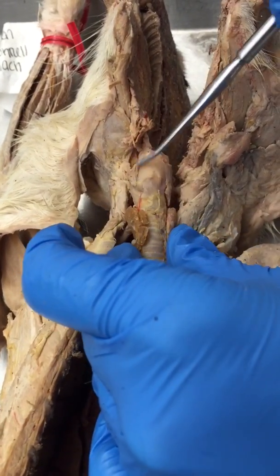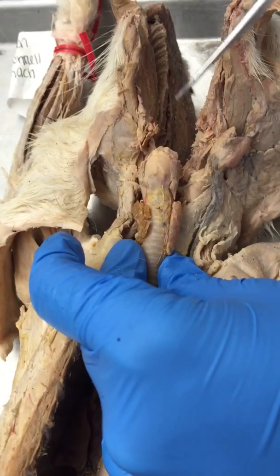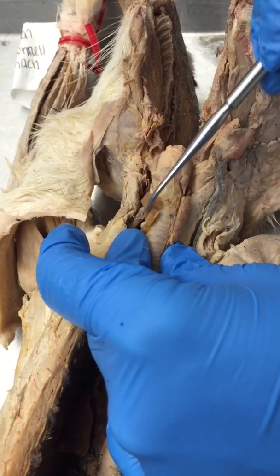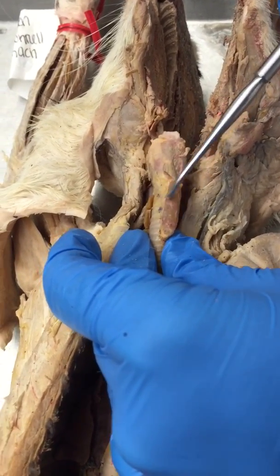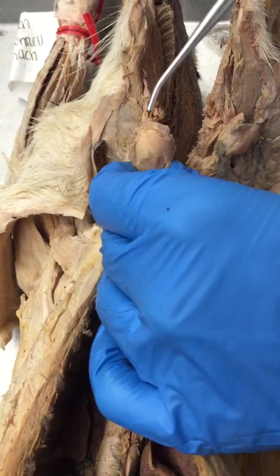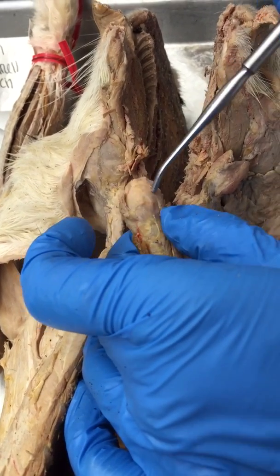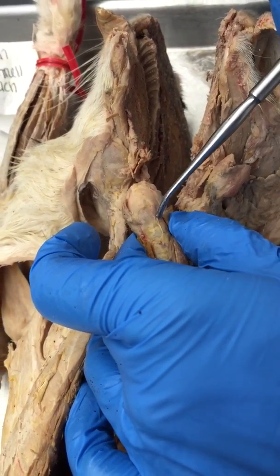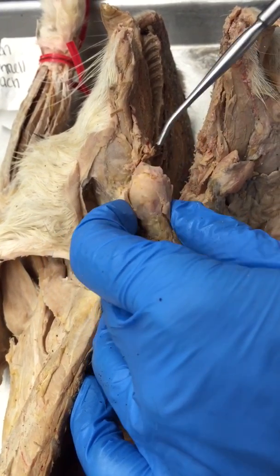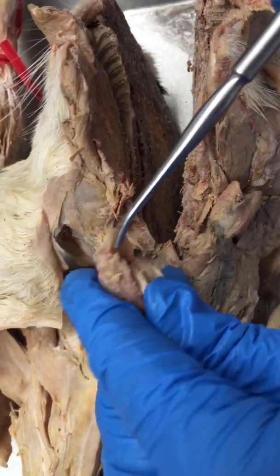Here's an anterior view of the larynx, which we had to carefully dissect out as it was covered by a lot of muscle tissue. Here we can see the bilobed thyroid gland that sits below the larynx. This part of the larynx is the biggest piece of cartilage — that's the thyroid cartilage — and the cricoid cartilage is below that. What you can see sticking up back here is the epiglottis.